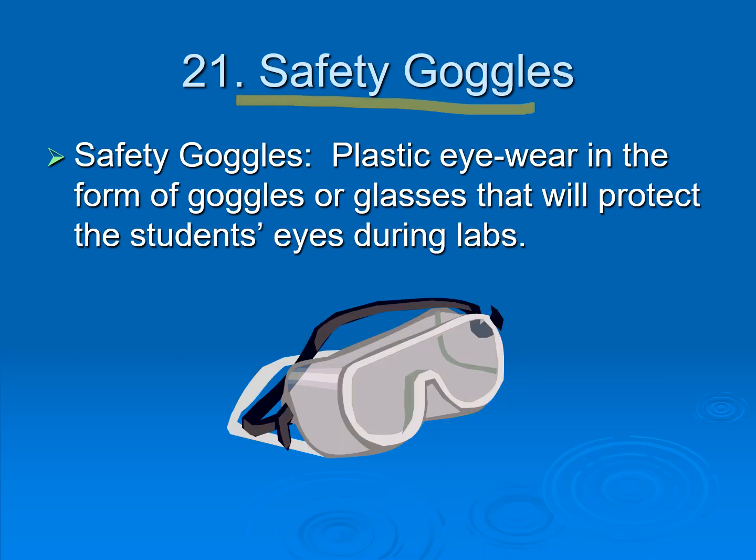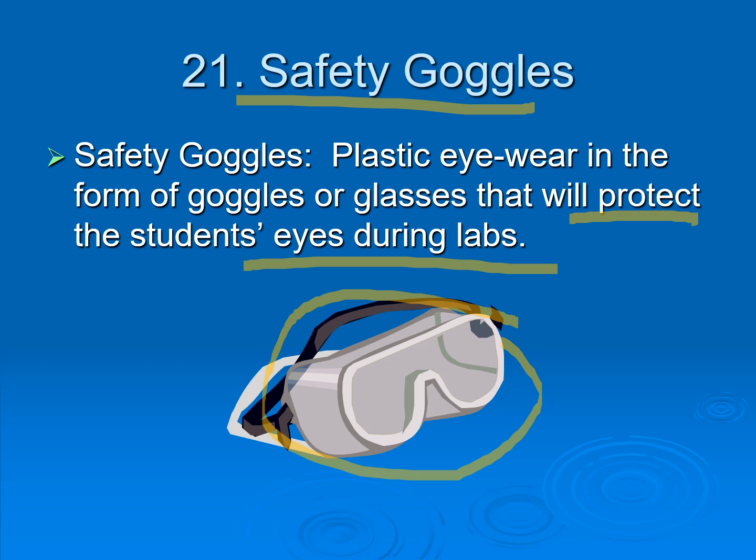Next is safety goggles. Safety goggles are used to protect your eyes during laboratory exercises or activities. There is always a risk that chemicals may splash into your eyes, which could cause blindness. So the purpose of safety goggles is to protect your eyes during laboratory work.